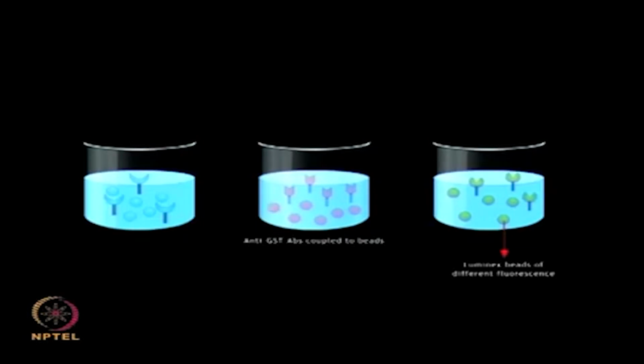We will now look at another application, rapid bead based assay for multiplexed detection of antibodies to EBNA1 and p53, a study by Wong et al. 2009.